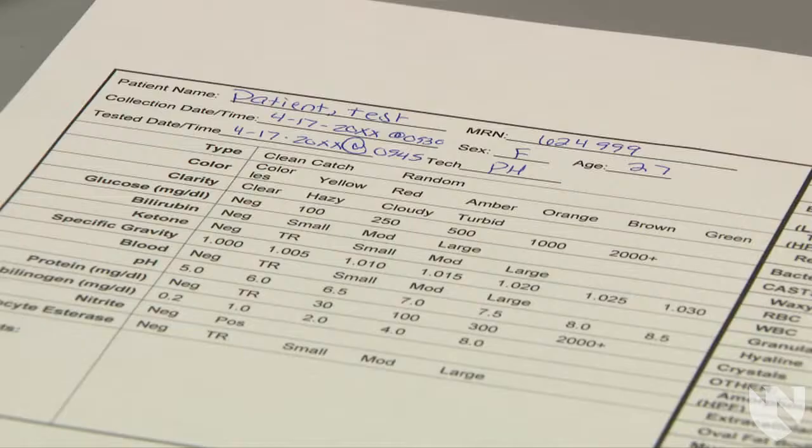If you are in focus and still unable to find any elements, it is possible there are not a lot of elements present in the urine. In this instance, it would be a good idea to refer to your chemical analysis of urine and determine if you should be seeing anything.